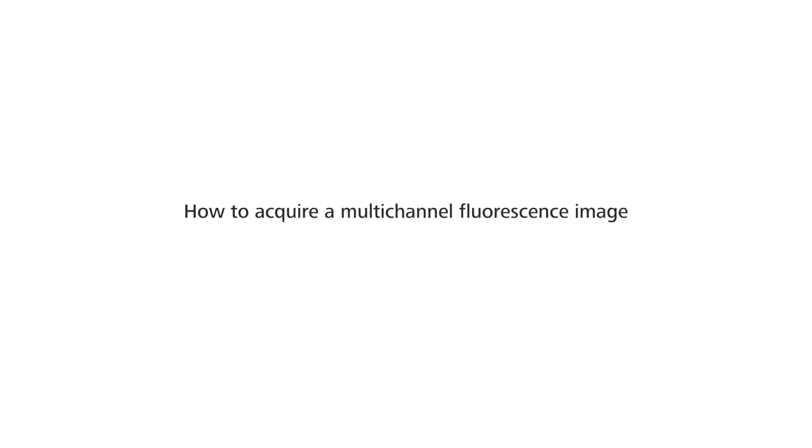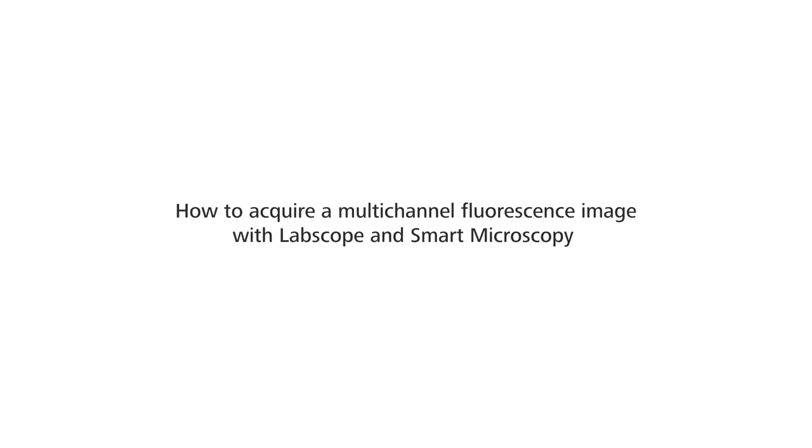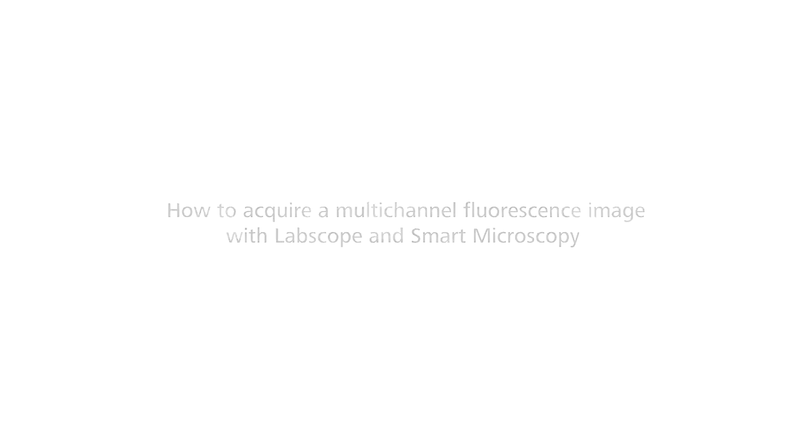How to acquire a multi-channel fluorescence image with Labscope and smart microscopy.